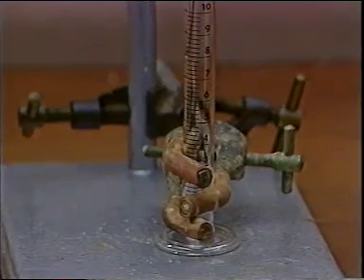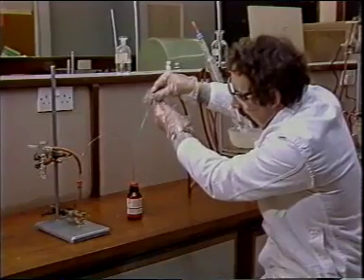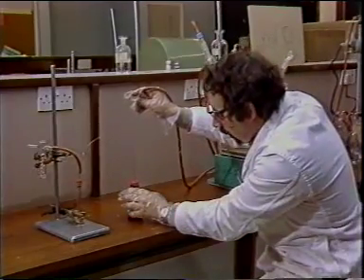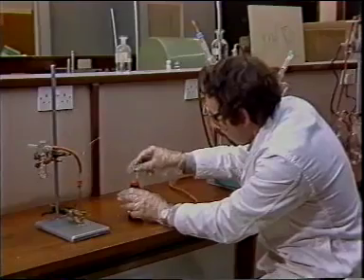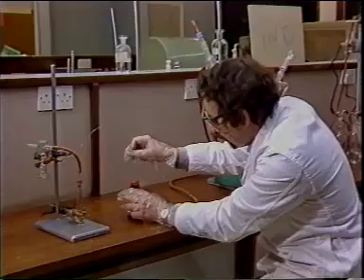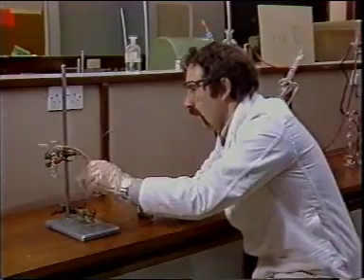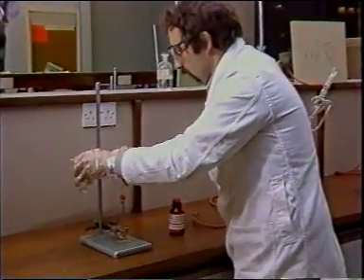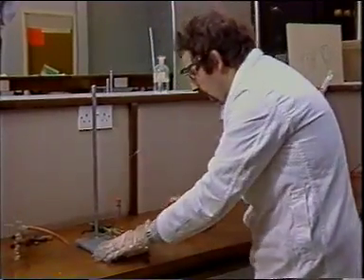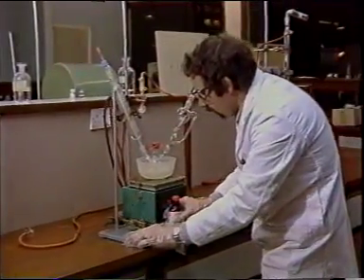When we have the necessary amount of reagent transferred, we can close off the nitrogen, withdraw the needle, and raise the catheter above the level of the solution. We then remove the nitrogen leak and transfer our measured amount of reagent close to our reaction vessel.